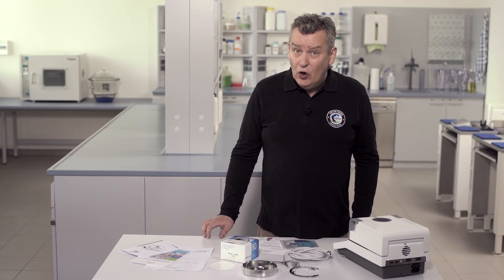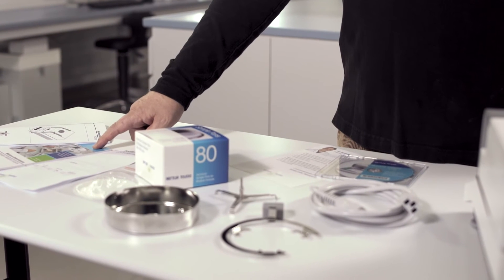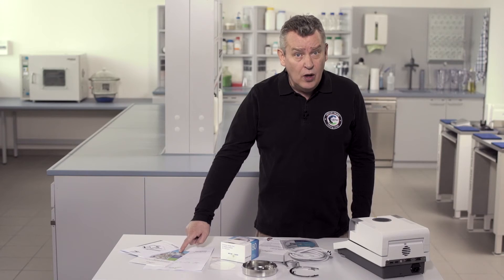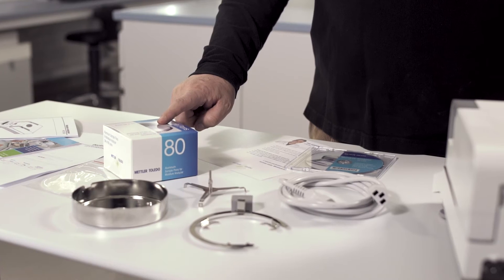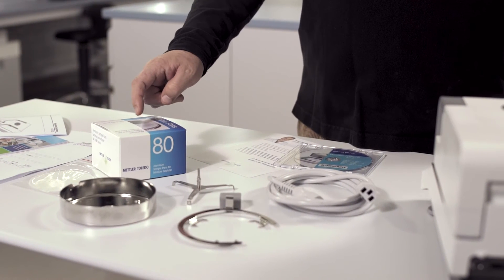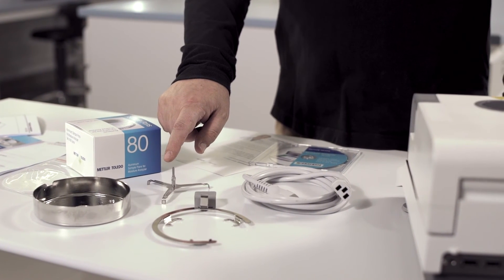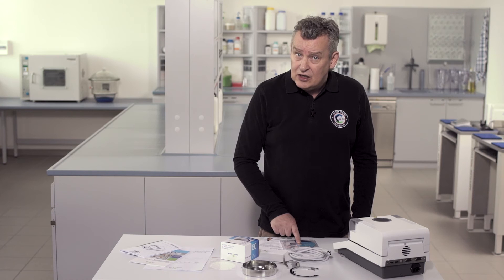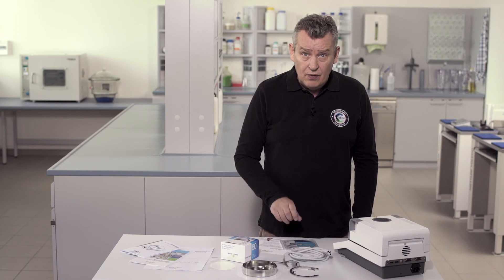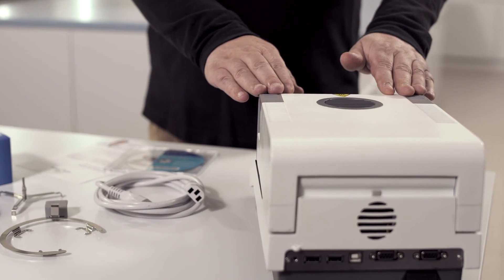The packaging contains the following components: the quick guide operating instructions, a moisture guide which contains useful information and know-how about moisture analysis, a CE declaration of conformity, a box of aluminium sample pans, filter papers, a draft shield, sample pan holder, sample pan handler, a power cable, a CD containing documentation in many languages as well as SOPs for routine testing and this installation video, and finally the HC-103 Moisture Analyzer instrument itself.